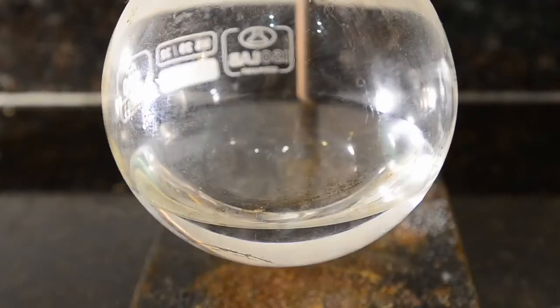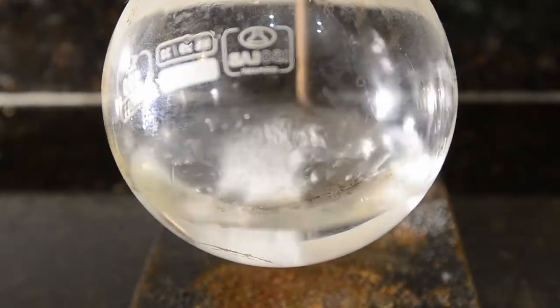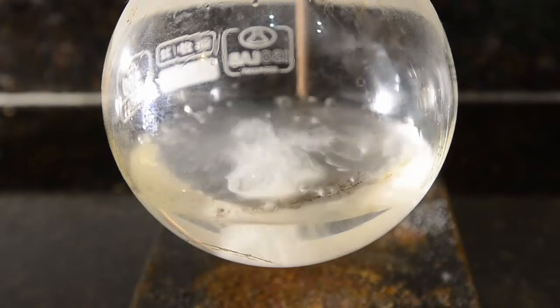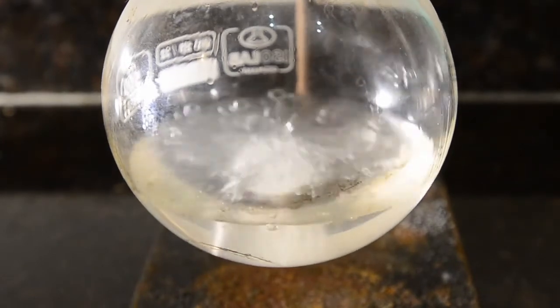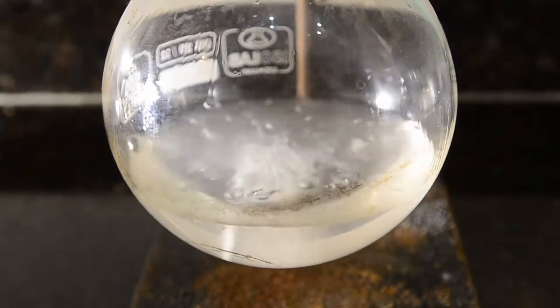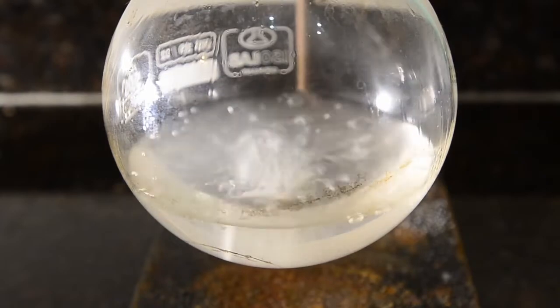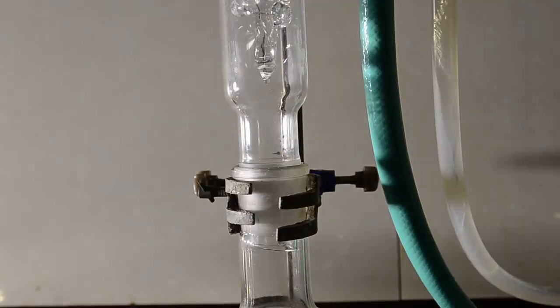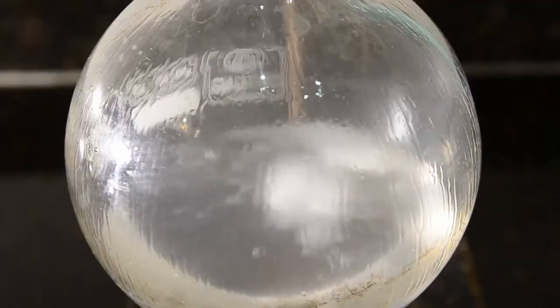Temporarily remove the condenser and add the sodium to the methanol in the flask. It starts to react very rapidly producing hydrogen gas, and the mixture will get hot. Replace the condenser and allow the sodium to react and dissolve.